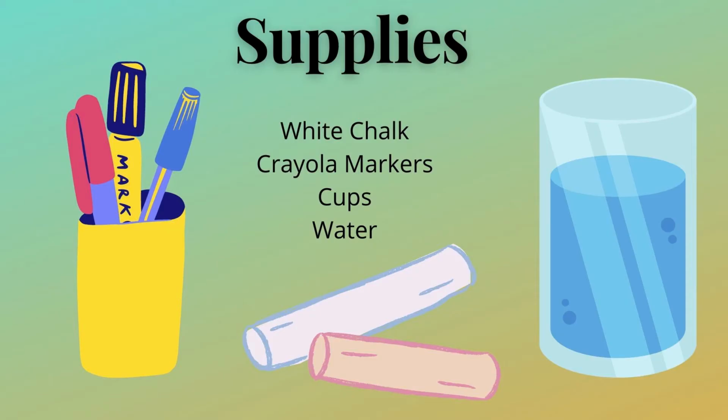All right, it's time to start the last experiment for this lab. So I'll go ahead and put the supply list up. You can push pause, go get everything, come back, and we'll start this lab together. All right, I have my supplies.